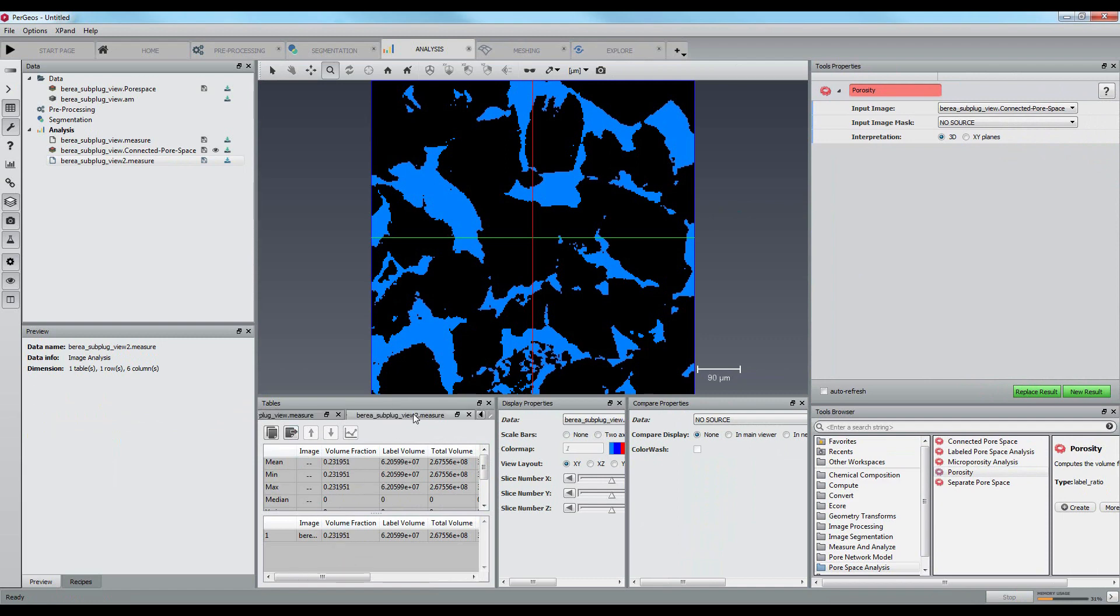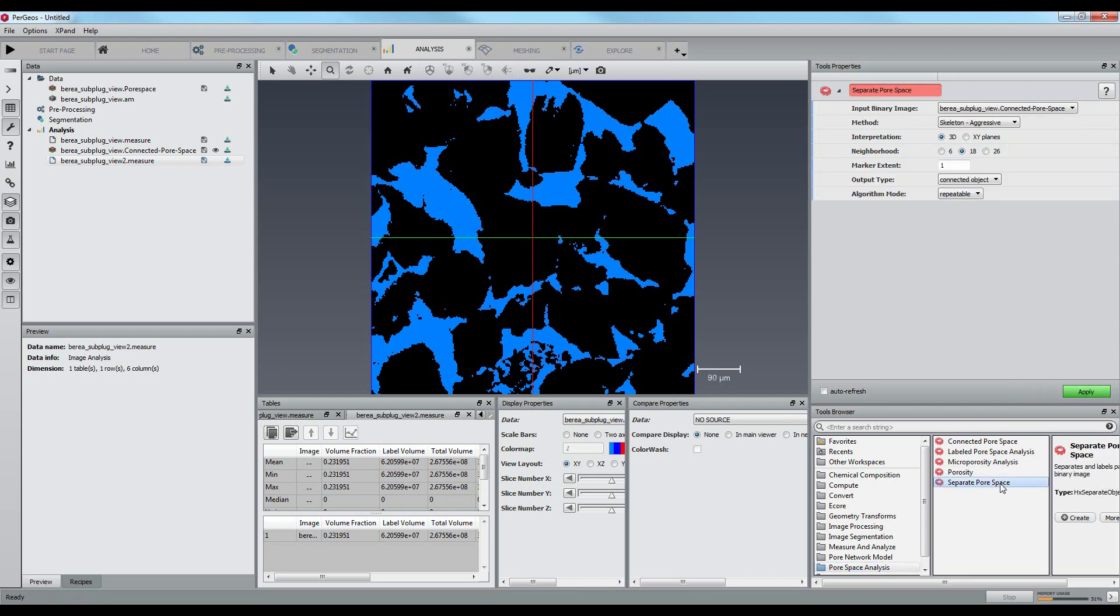Let's now compute the pore size distribution. We will begin by separating the pore space with the separate pore space module.